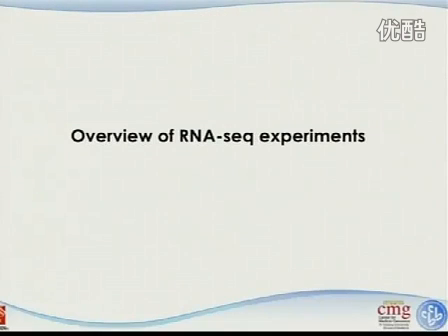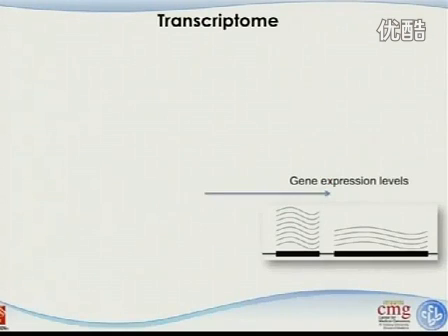All right, let's start with the overview of the RNA sequencing experiment. When we think about RNA sequencing, the first thing that jumps into our heads is that we want to use it to study gene expression, right? For example, there are 2 genes here with some copies. There are more copies of this gene, so the expression level is higher in this gene than in this gene. We are hoping that RNA sequencing can help us solve this problem, which is great. And microarray does a pretty good job on this as well.